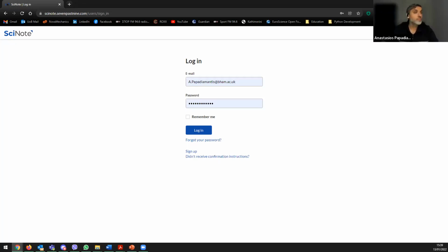Cool. So going back to the live demonstration, or maybe one question from my side, Tasso. Sorry to interrupt. Any country restrictions? Because you said that you can use it worldwide. Not that I have experience, but Thomas can answer this question. He's here. From what I know, China sometimes has restrictions with Google and stuff. Is this hitting maybe here?